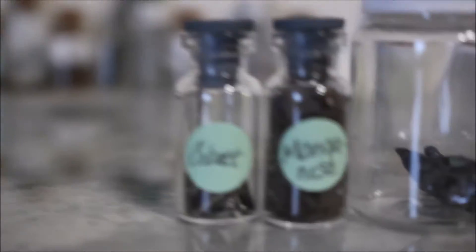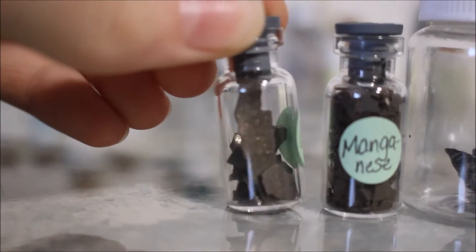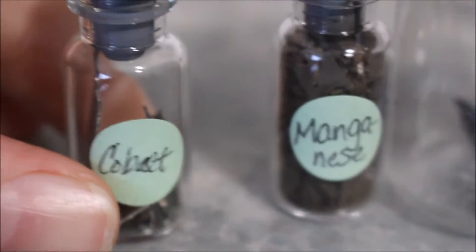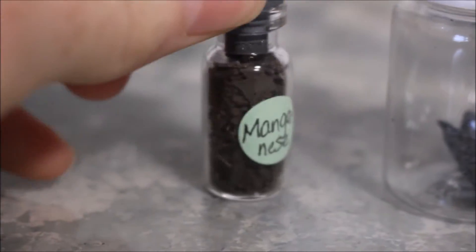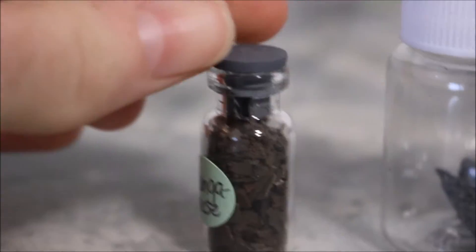Next is my cobalt sample. It's really pretty. Next is manganese. I think I got a layer of manganese dioxide on it, but sometimes I can see the metal.